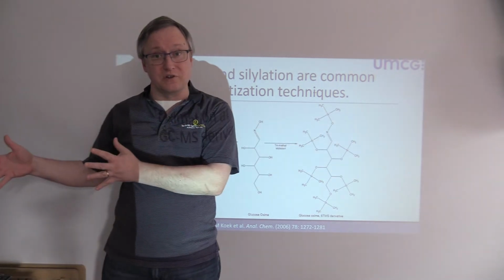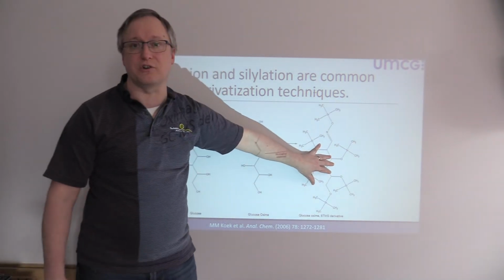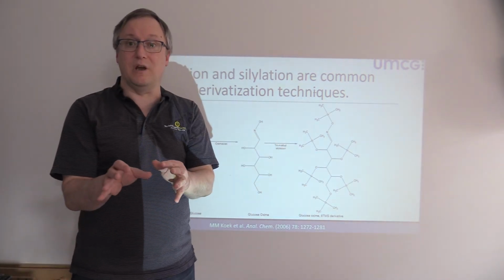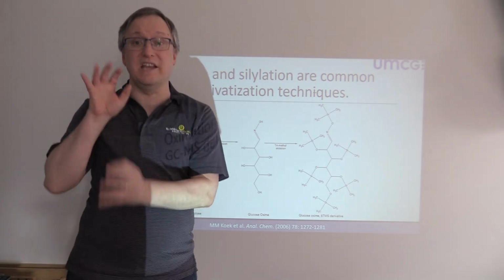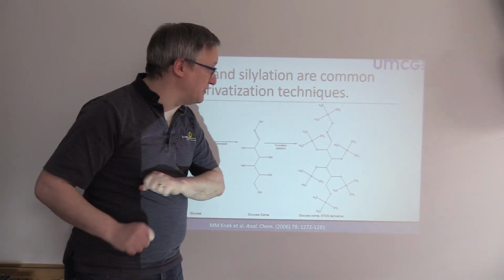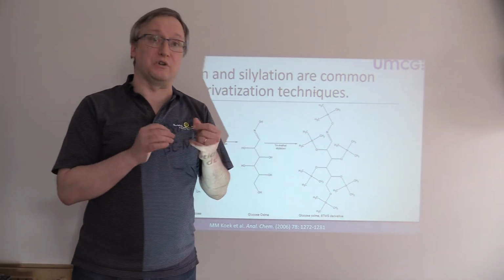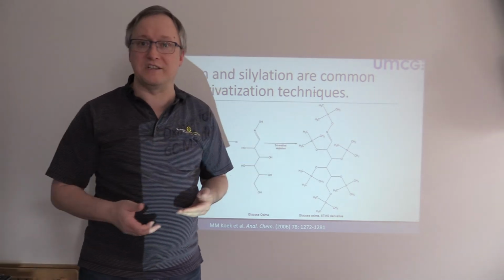They were different sugars coming in, but one structure, this 6-TMS structure, afterward. So it may be the case that the derivatization process is going to turn molecules that had slight chemical differences into something that's all one thing. That can cause us problems when we're trying to quantify all the different 6-carbon sugars that were in the sample to begin with.